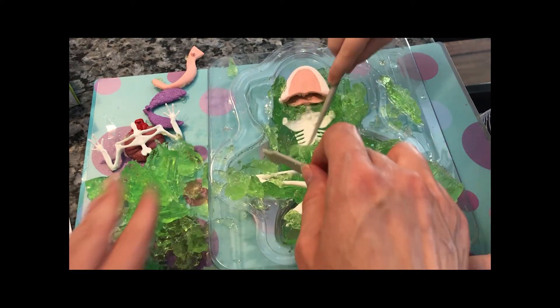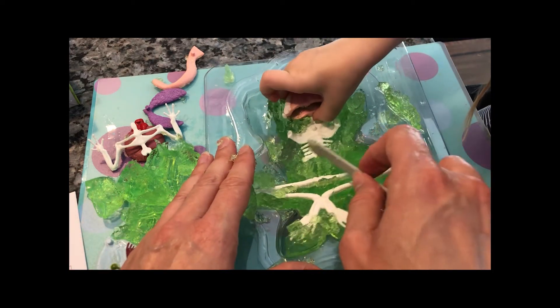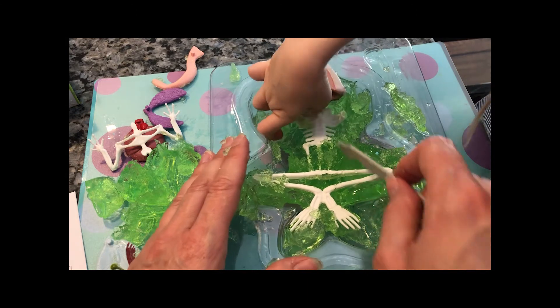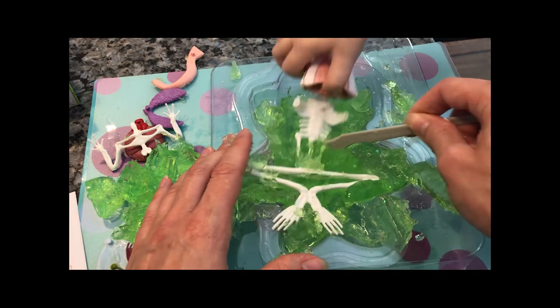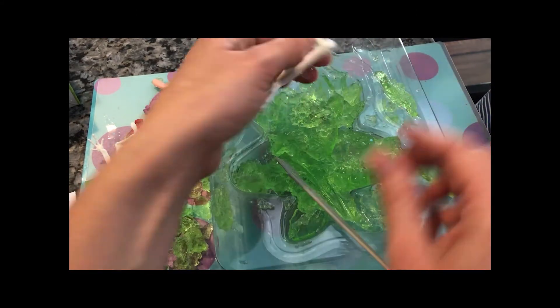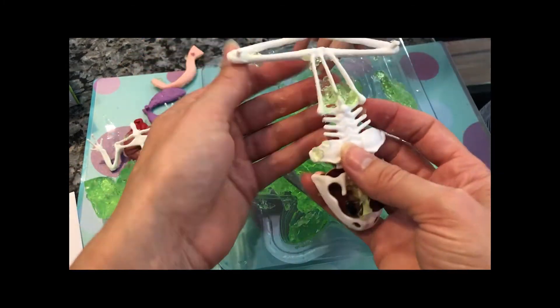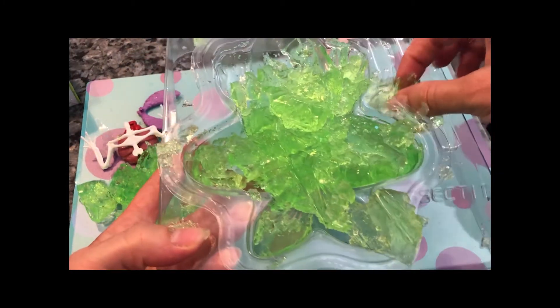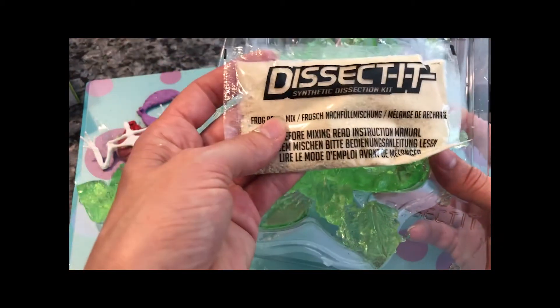I found that. It's a part of the skeletal system. I think we have to take the whole body out. So we've got the frog skeletal system. We can actually reuse this mold to make another frog. That's what this stuff is if we want to do this again. You think you're going to do this again?